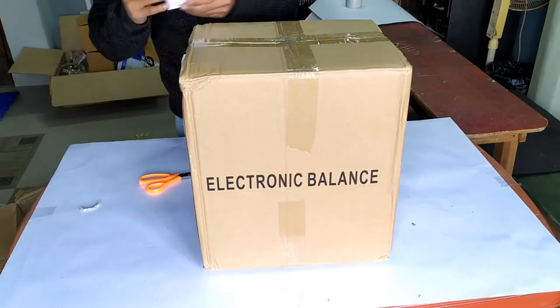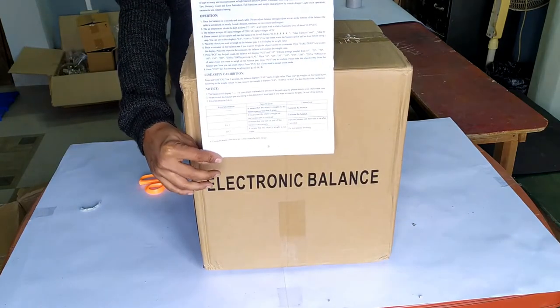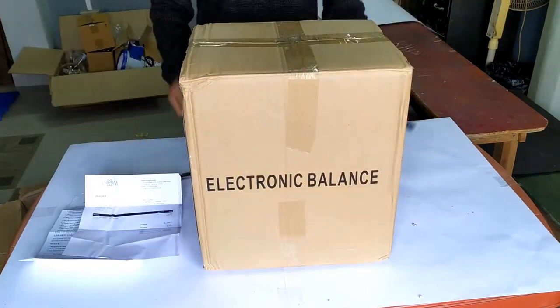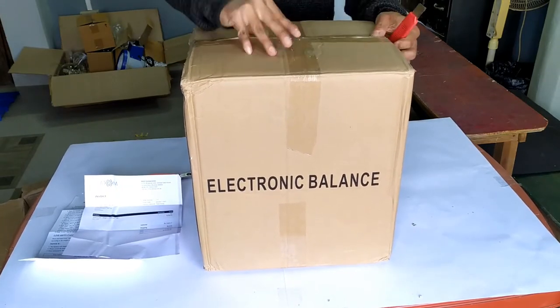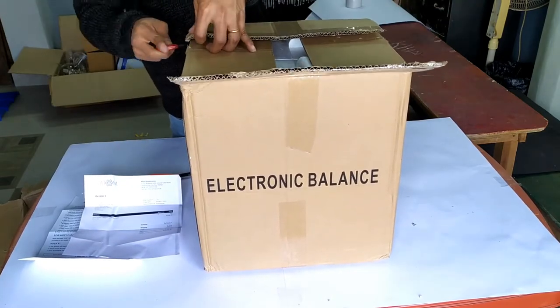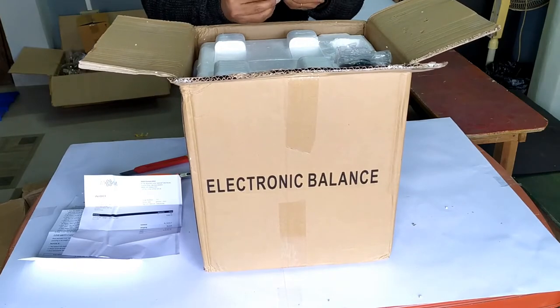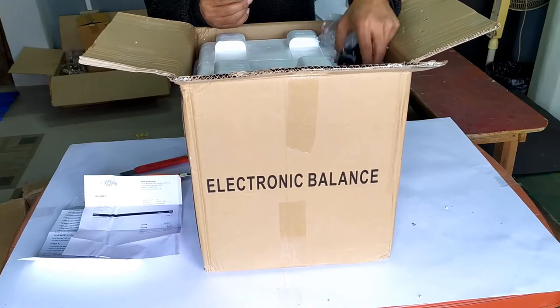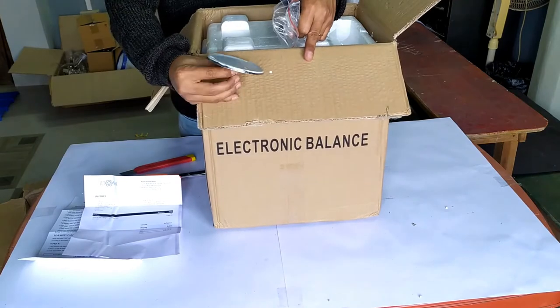Here is the user instruction manual and the product receipt. And finally we get a glimpse of the Thermacol packaging that holds the weighing scale inside. The weighing pan, the power adapter and the standard 200g weight for calibration are all packed on the outside of the Thermacol box.